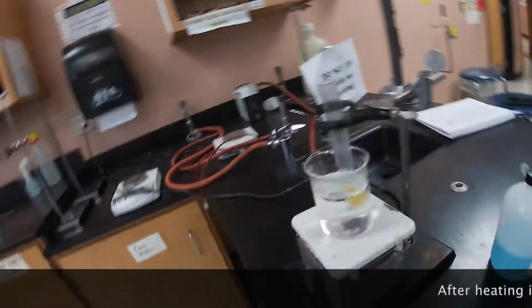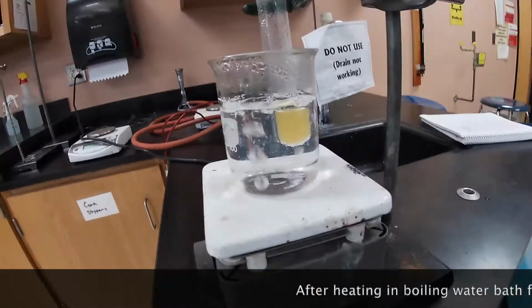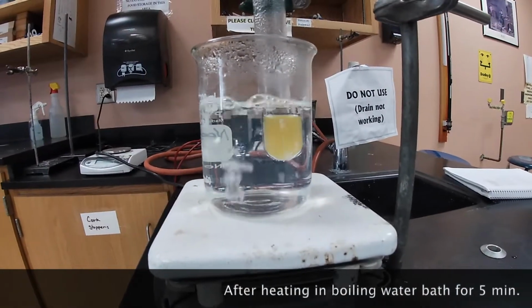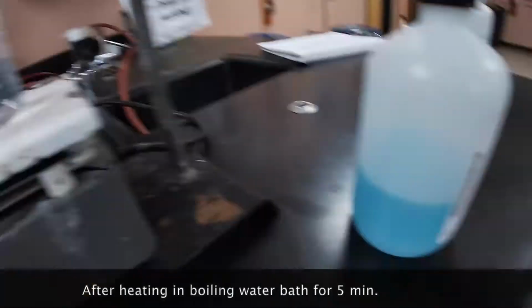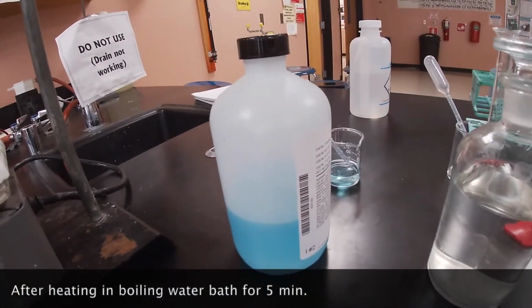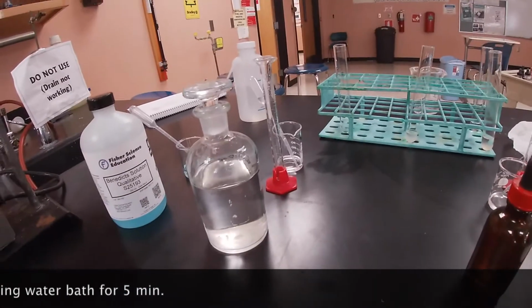After placing the Benedict solution and glucose solution into boiling water for about 5 minutes, this is the positive test to notice that there is glucose in there. If you notice, we started off with the Benedict solution, which is a hint of blue, and then we have our glucose solution.